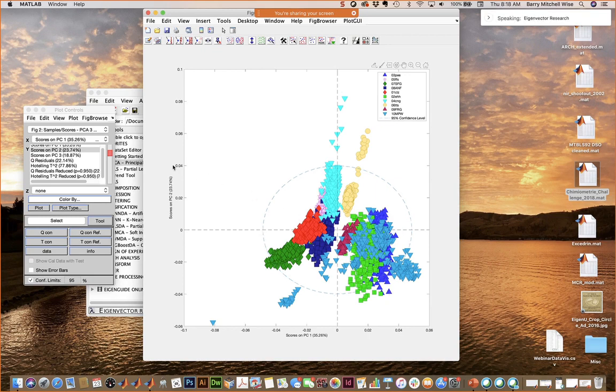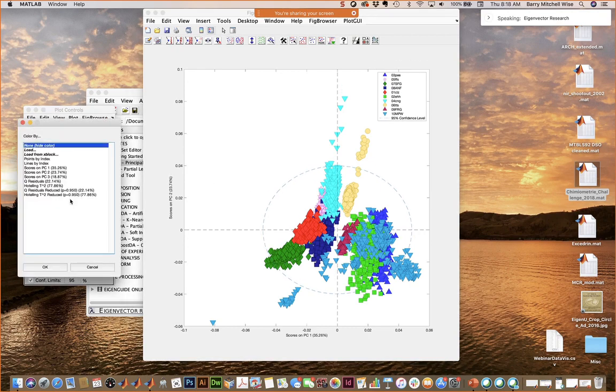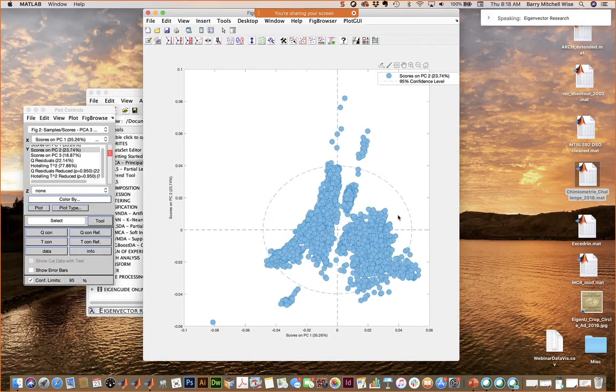Another thing that you can do in this data set, I actually included as an axis in here the protein content of these. And these are all different foodstuffs. But here, because I put the protein content in here, I can actually use that to color them by, except I think I just grabbed the wrong version of this, and I didn't put it in there because it's not on my list. But if I had that, I could use that too.